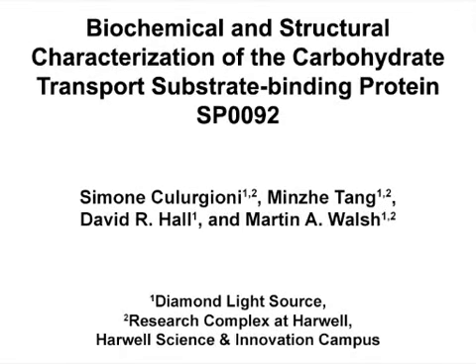The overall goal of this procedure is the biochemical and structural characterization of a carbohydrate substrate-binding protein from Streptococcus pneumoniae. This method can help provide key data to aid in structural studies of substrate-binding proteins, such as the identification of their buffer stability profiles, oligomerization states, and atomic structures.